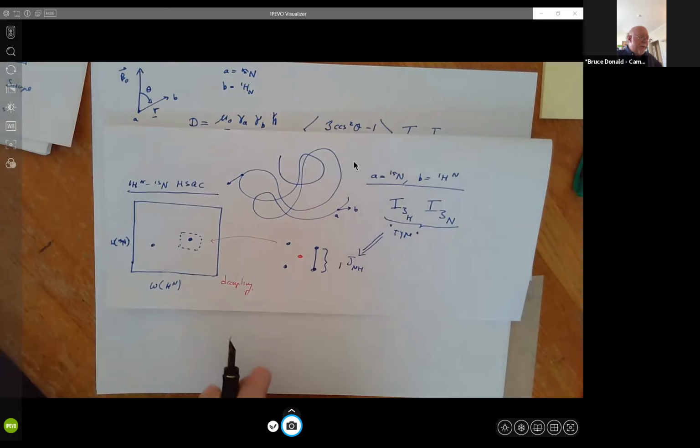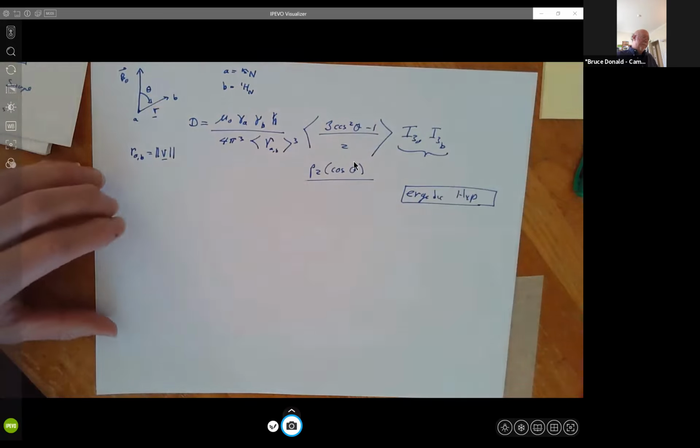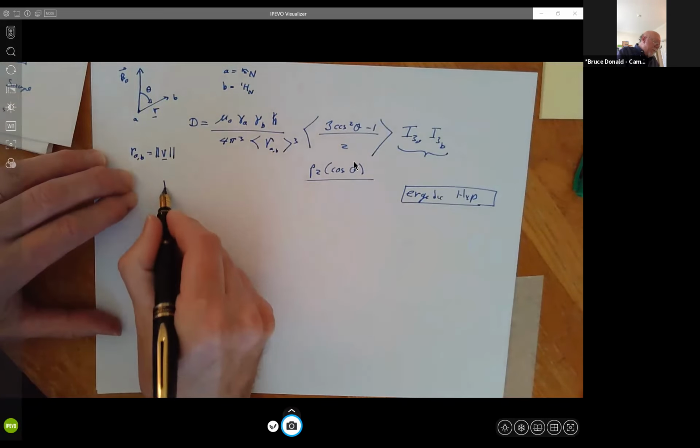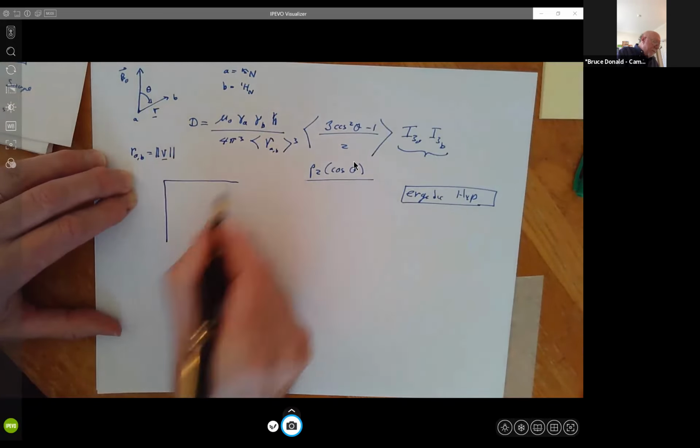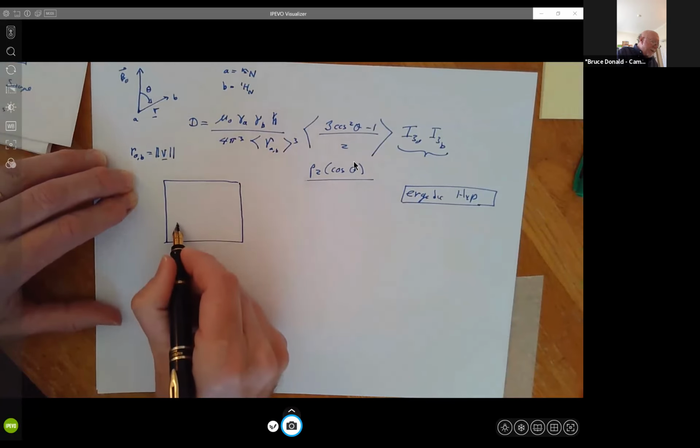And so the trick I'm going to use is to turn off the decoupling just in the N15 dimension. So I'm going to have splitting in the vertical N15 dimension, but not in the proton dimension. And so my spectrum is going to look a little bit different. Whereas before, I had spots that looked like this, right?